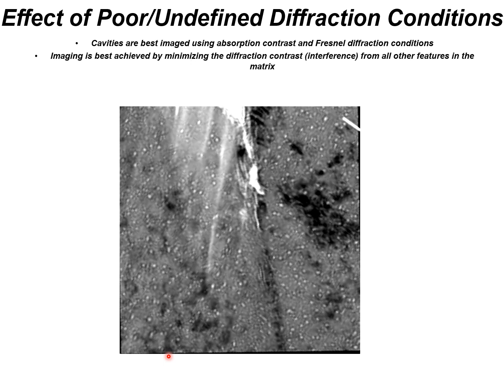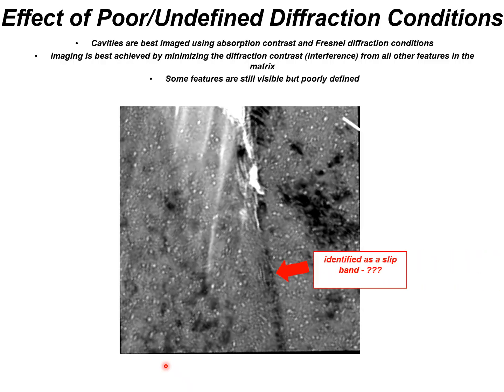And one of the reasons is when you have a slip band, the edge of the slip band, which you think of as an edge of a slip band, isn't really an edge. It's just where the plane, which is the slip plane, intersects the foil surface. So you have a big wide plane and you're taking a slice through it. And hopefully I've got that here.